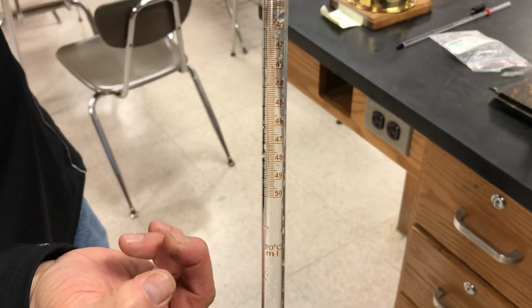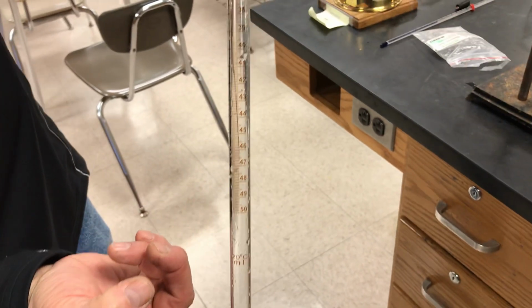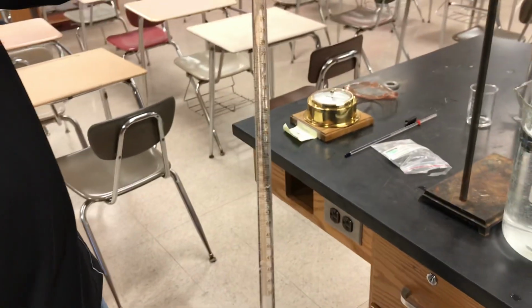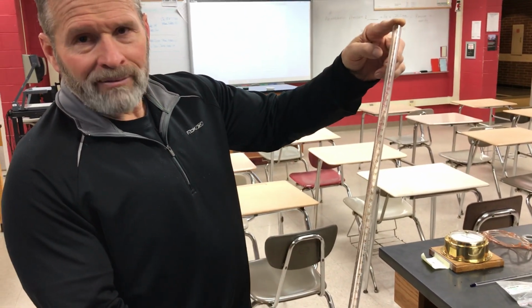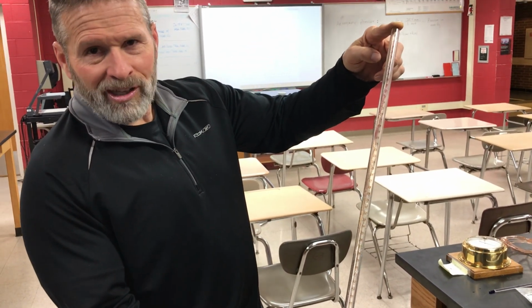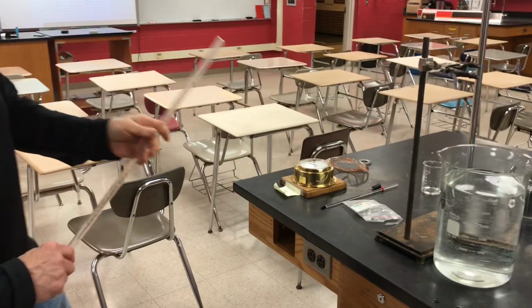Yeah, those collecting bottles in the last experiment weren't graduated. We had to pour it into a graduated cylinder, whereas this will just directly give us what the volume of gas collected is. Nice. I'm sure we had a fair amount of error last time trying to measure that volume. You think so? Yeah. Remember how we got over 100% yield for many groups? This should be an improvement. So we're going to use that today.